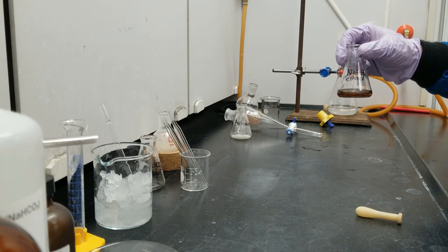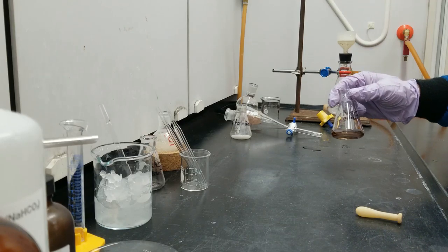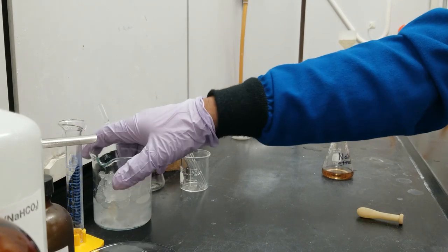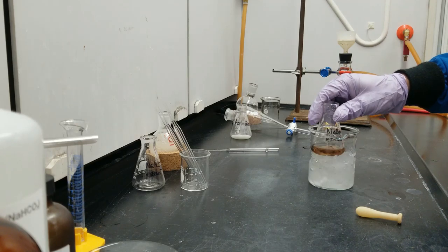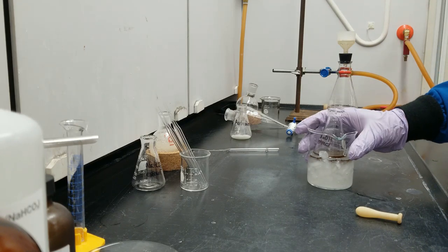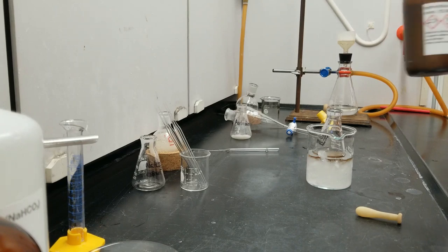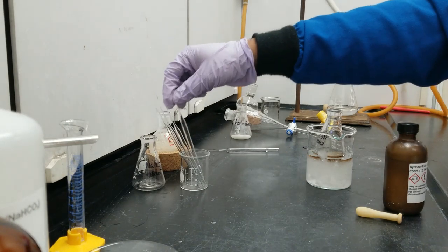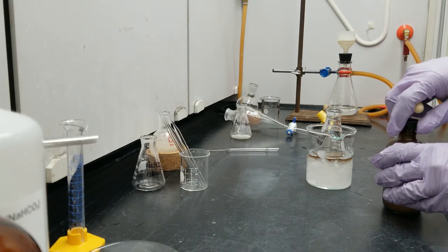Now I will be working with the sodium hydroxide extract to isolate the naphthol. For that, we will be cooling the extract down using an ice bath and then add HCl, 12.1 molar, that is concentrated hydrochloric acid, similarly in a dropwise fashion until the solution is acidic. That is, the pH is about 1 or 2, and we'll check that with the pH test strips.